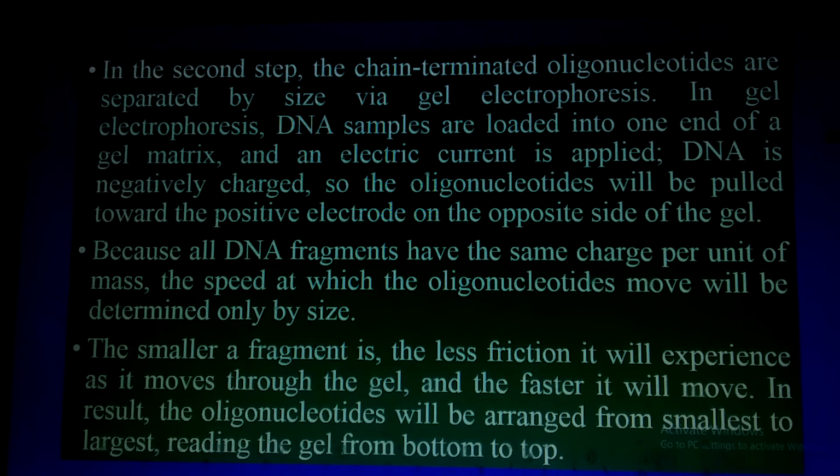The speed will be determined by the size. The smaller a fragment is, the less friction it will experience as it moves through the gel. Is it clear? And the faster it will move. As a result, the oligonucleotides will be arranged from smallest to largest. So we arrange the nucleotides from smaller, I will show you, regarding the gel, from bottom to the top.